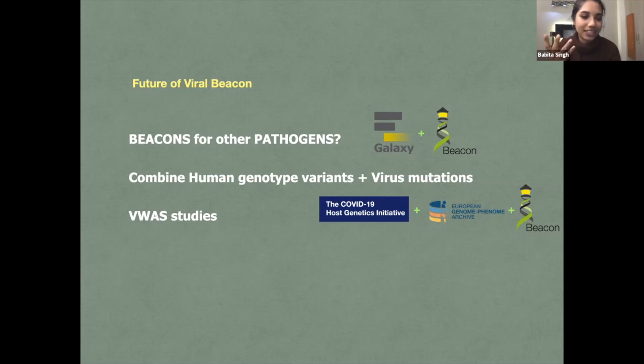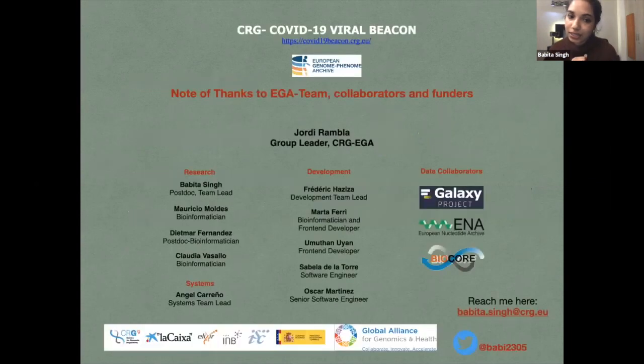And I thank Galaxy and the Galaxy team for providing us data, and ENA for making their data open source and publicly available. With this, I would also like to say thank you to my team, the EGA team. Especially in the beginning when it was in development, we put tireless effort into making something quick, but also robust.